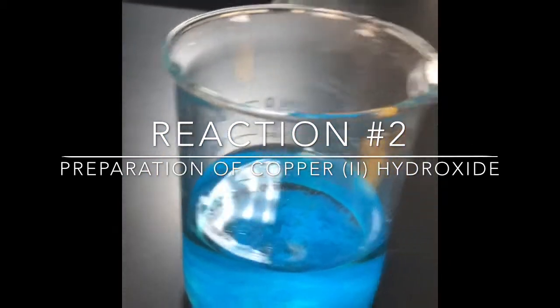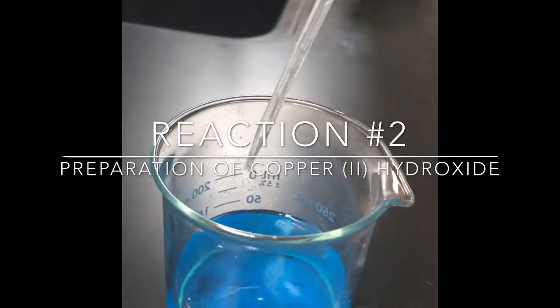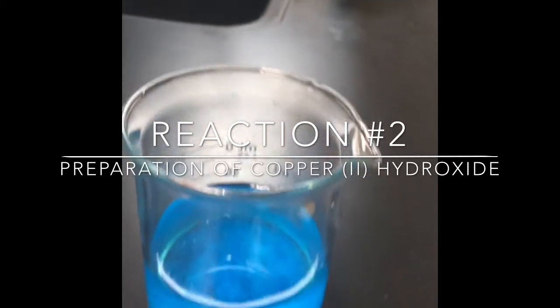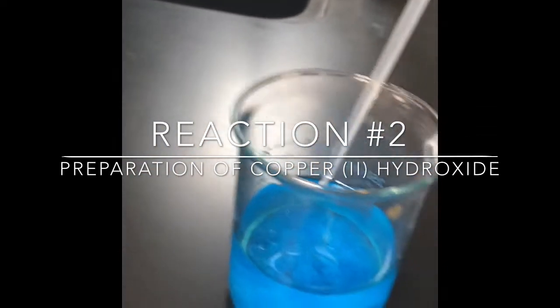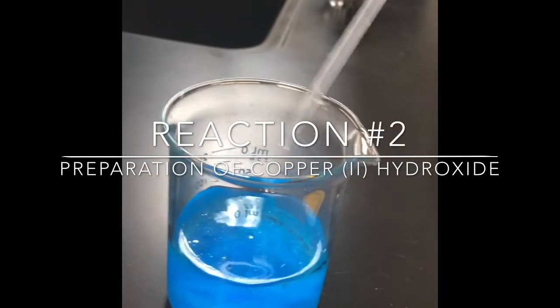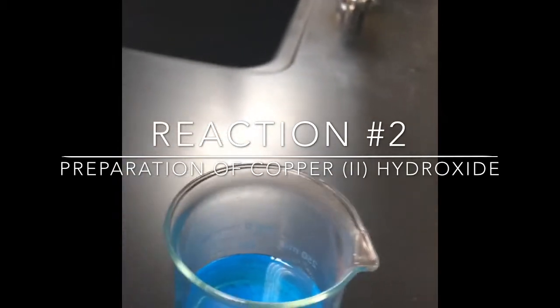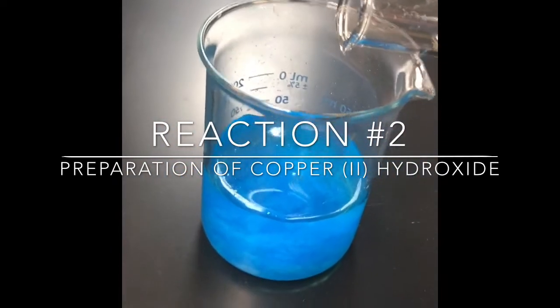Okay, so I'm just adding dropwise, and I'm going to keep doing this until I've added all 15 milliliters of sodium hydroxide. So let's just slowly add this in.